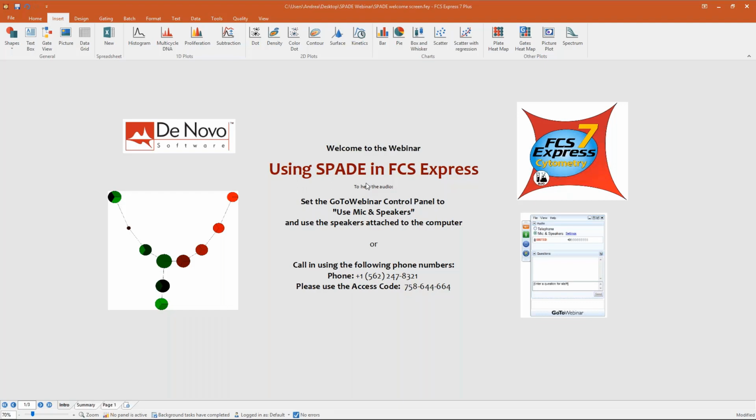I think those are great tools. It's true that they have been around for a while, but in flow cytometry they are still kind of new. I mean, t-SNE, FlowSOM, SPADE, UMAP. I think we are learning every day how to use them on our data sets. And again, I also want to mention that there is nothing like a best practice, because on some data sets you may get better results with SPADE, and on other data sets you can get better results with t-SNE. So it's really learning by doing.